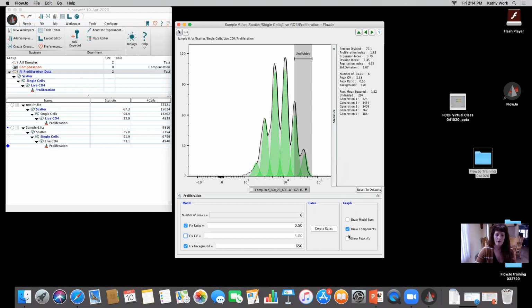You might have to take that into account as well. So know the cells that you're working with, know the biology, understand that you might run into circumstances where the cells are pumping out, and you might have to treat with a certain drug to reduce that, to be able to get reliable data. So all of this does come with some caveats, and we'll absolutely help as much as we can with helping you out with that.